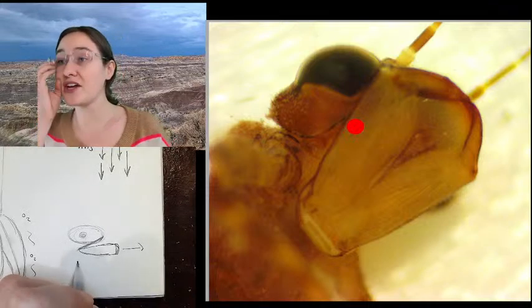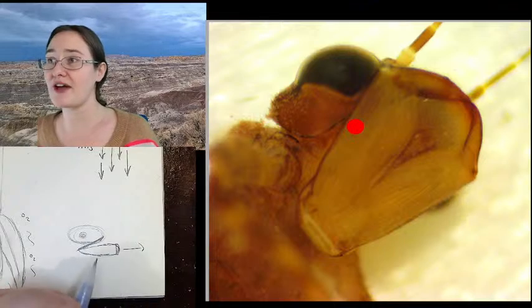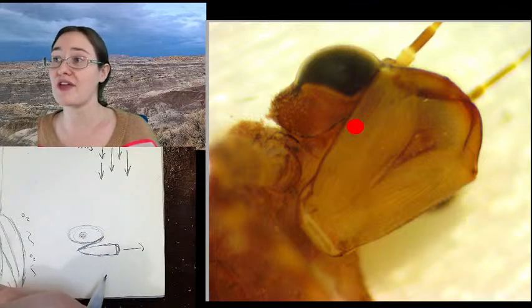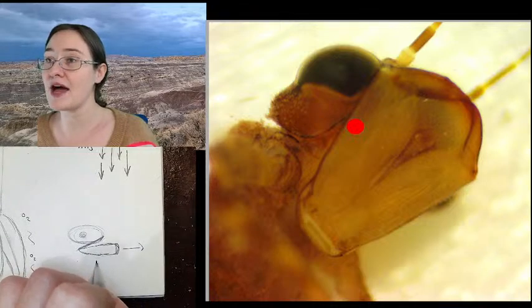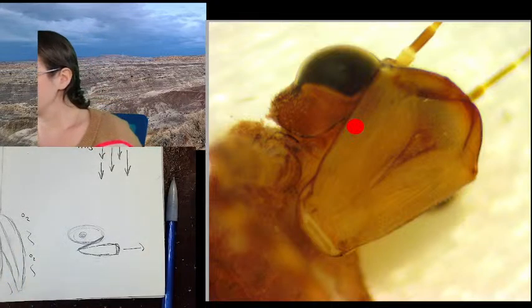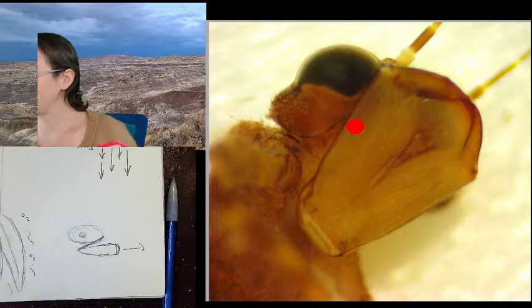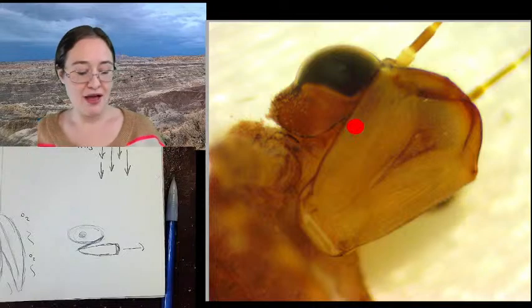And with the characteristics on this guy, you can almost identify a damselfly all the way down to family just by looking at its labrum, its labium, and its antennal segments. All right, so that's a little bit about him.